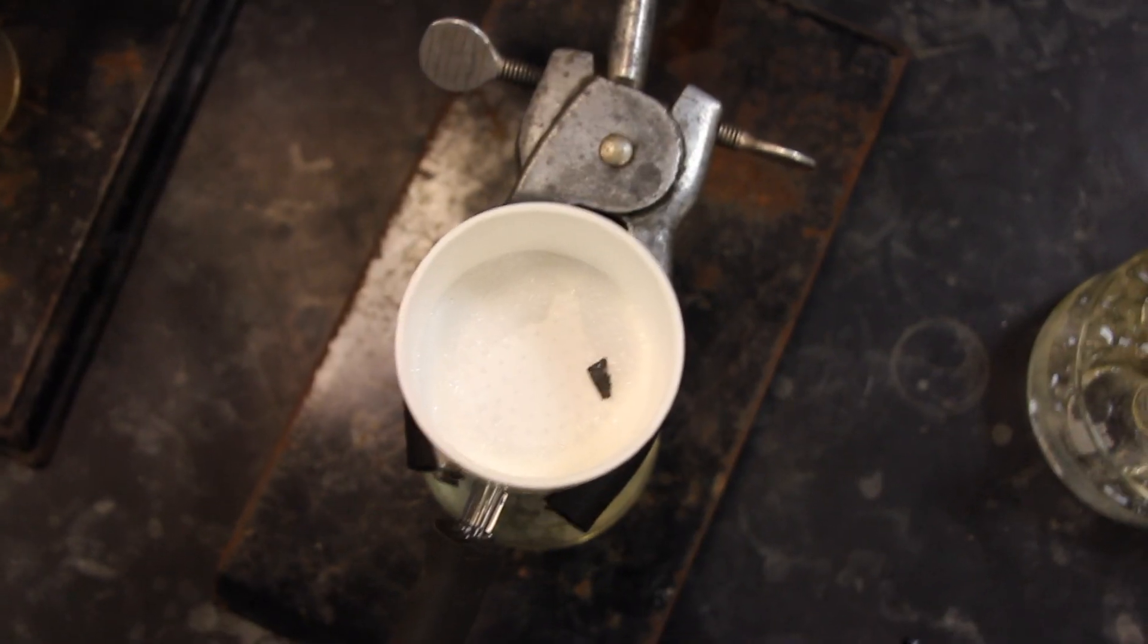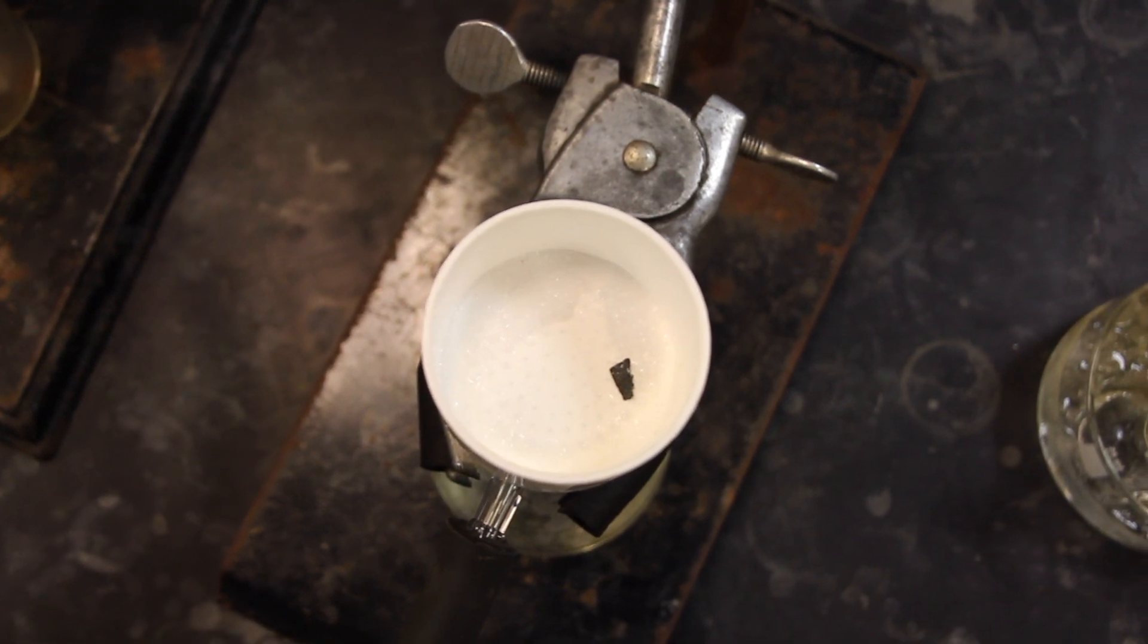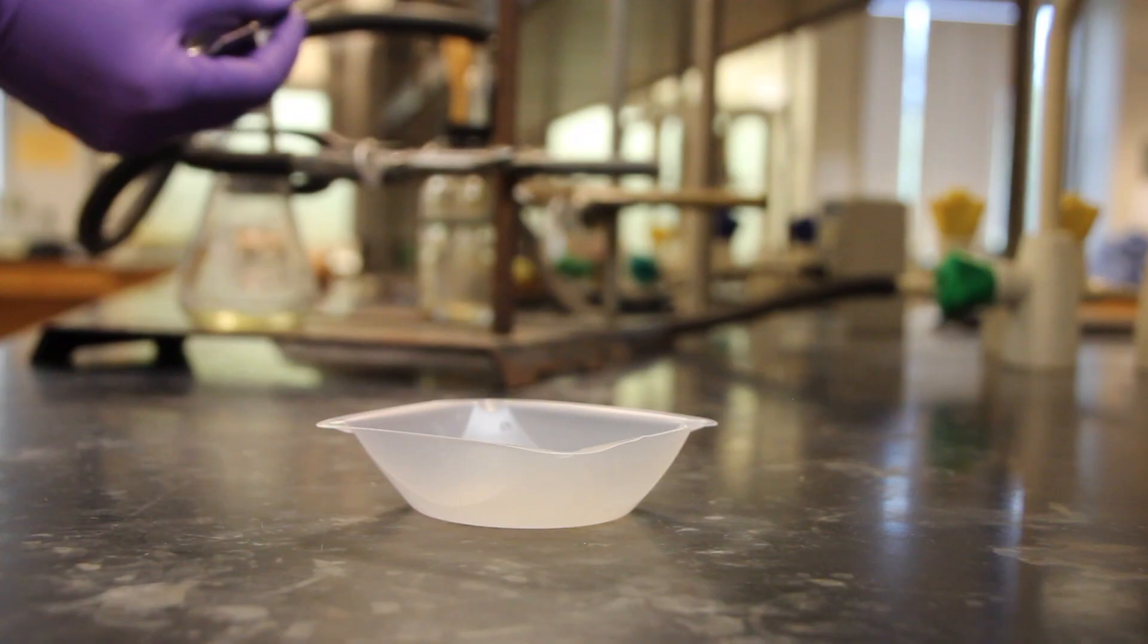After letting your crystals dry under a vacuum, obtain the melting point of your product and calculate the percentage recovery.